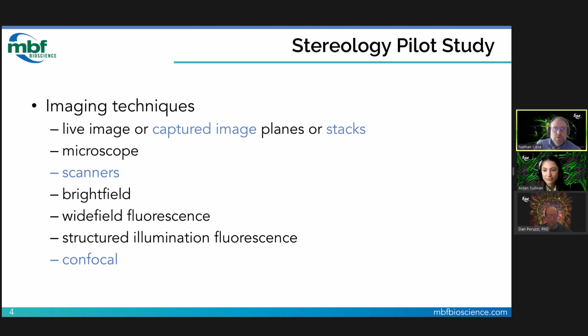So just going to jump in real quick. Aidan is bringing her image data in, just one of many different imaging modalities we support. You can work directly on the microscope as Stereo Investigator fully integrates with motorized microscope components. You can open and analyze bright field or fluorescent images from a wide variety of sources as well, from confocal scopes to slide scanners. Stereo Investigator can also drive and connect to structured illumination devices such as the MBF Bioscience device that produces a confocal-like image and can be added onto most microscopes. Additionally, we also support the Zeiss Apotome and Olympus DSU for this style of imaging.